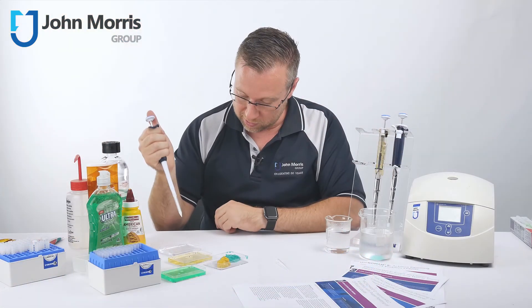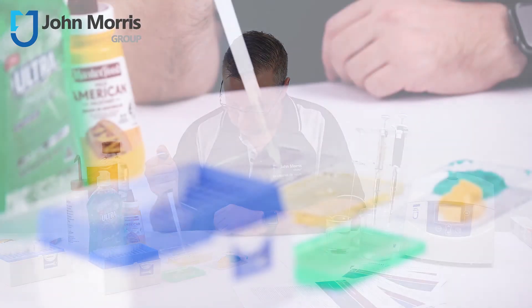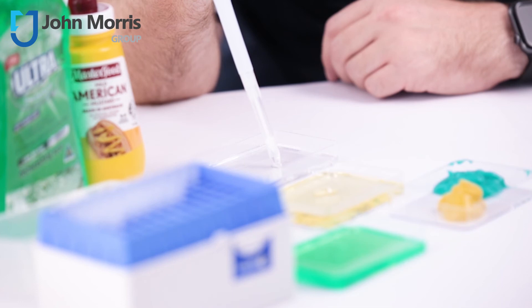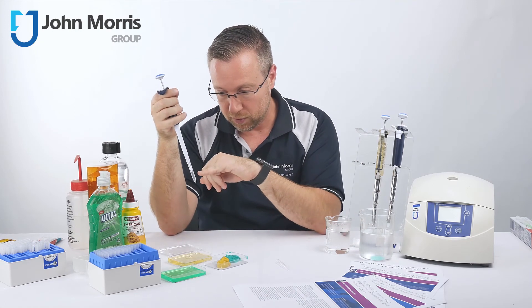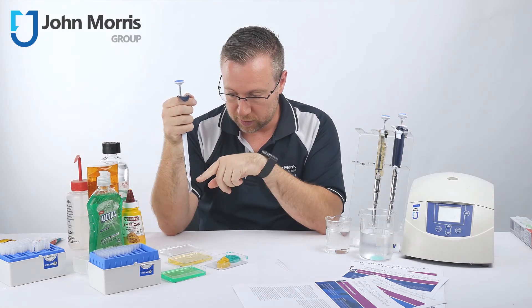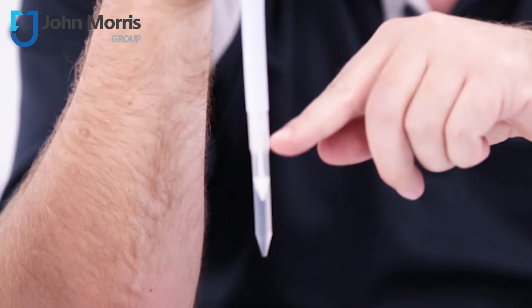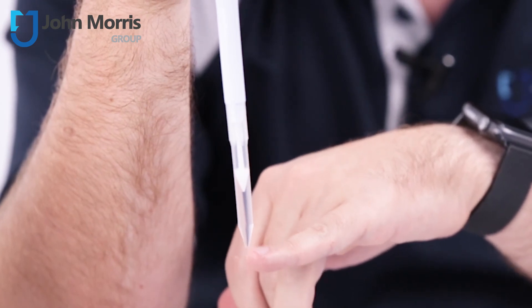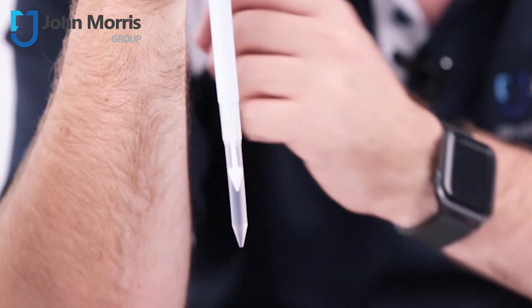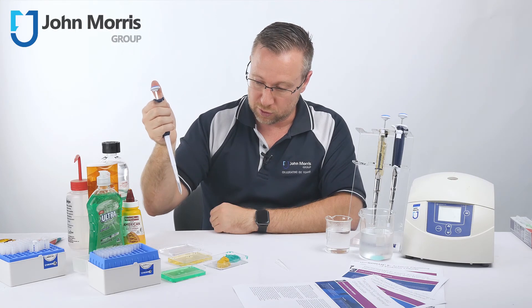Let's try that methylated spirits. You can see that there's no way it can evaporate beyond this point — it can't go up into the body of the pipette. There's no droplet forming at the bottom because there's no expansion of air. It's a very robust solution.